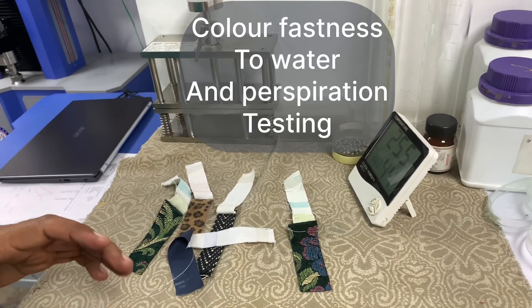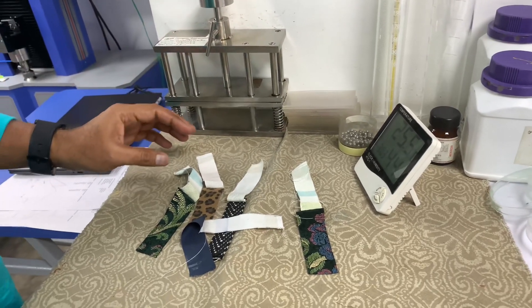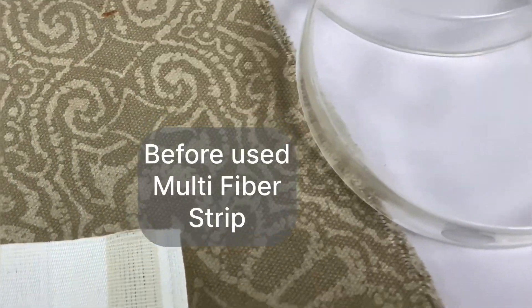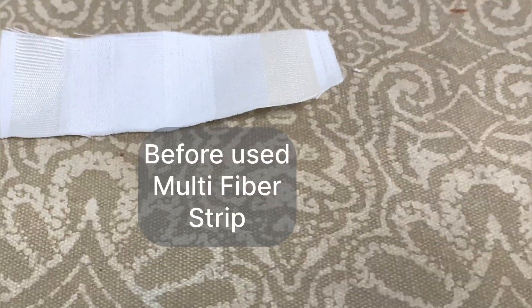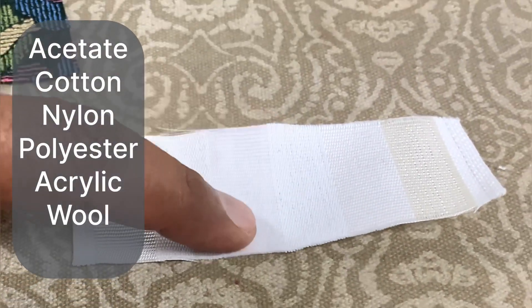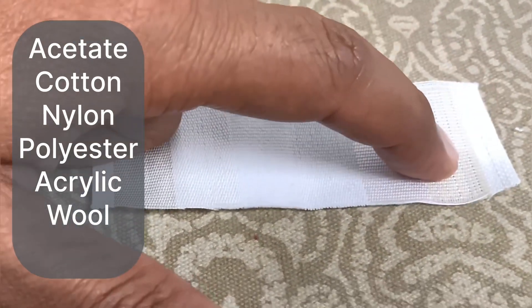Today's topic is color fastness to water and perspiration. This is a multi-fiber strip which we need to attach with the specimen to test. There are six fibers in this strip: acetate, cotton, nylon, polyester, acrylic, and wool.